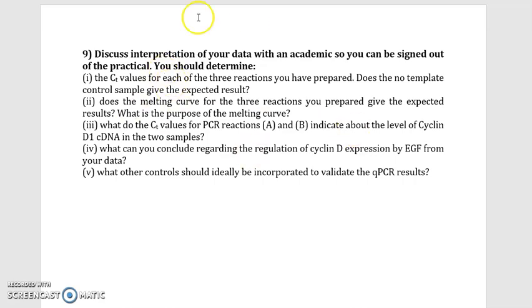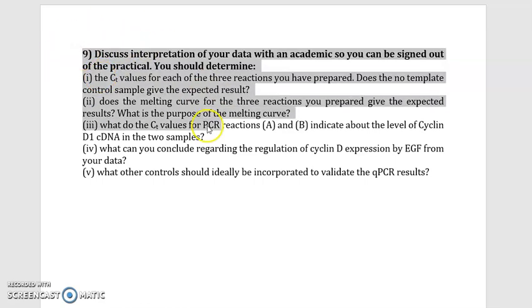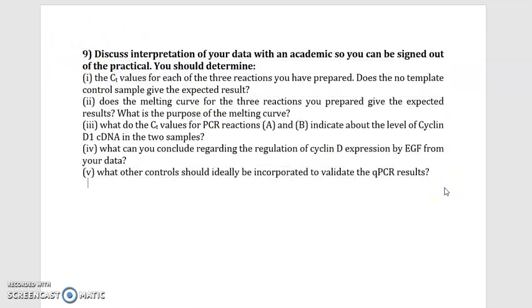Okay, so I'm just going to go through our gene expression practical and discuss the answers. Now I know that you can't see my results, but when we need to look at them, we shall look at them. And we will not, but I'll show you. I'll read out what kind of values I have.